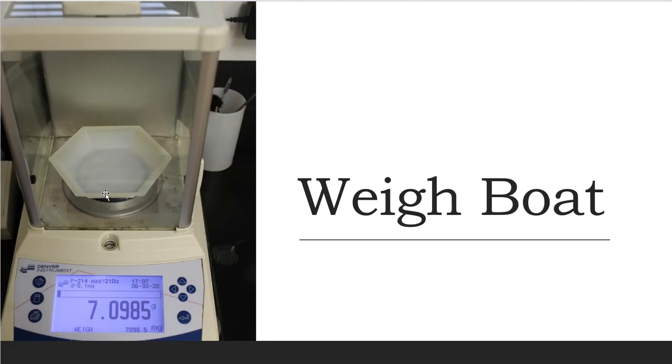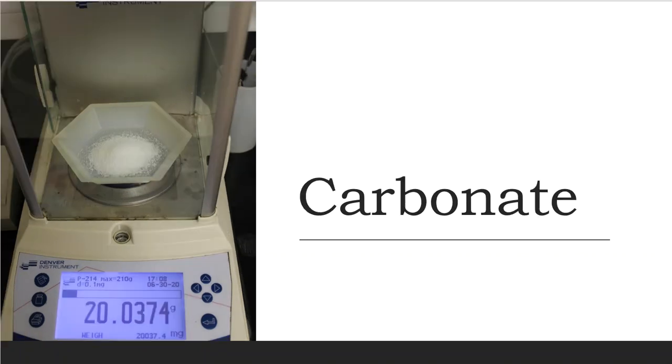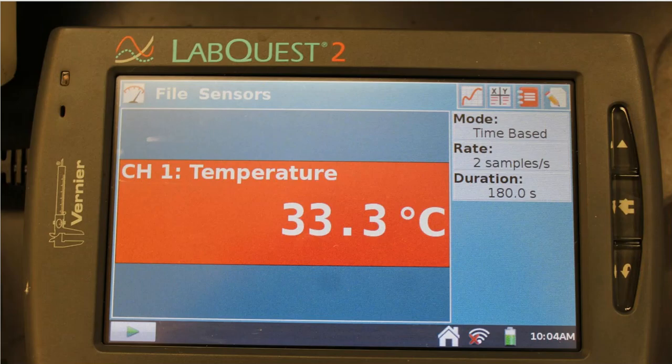So I took a large weigh boat because this is going to be a large amount. And that weigh boat is 7.0985 grams. I'm going to tare out that weigh boat, and then I'm going to add some potassium carbonate to that. And I got 20.0374. The lab directions tell me 20 grams. I think that's pretty close enough. What do you think?